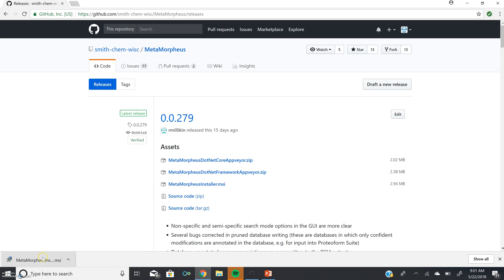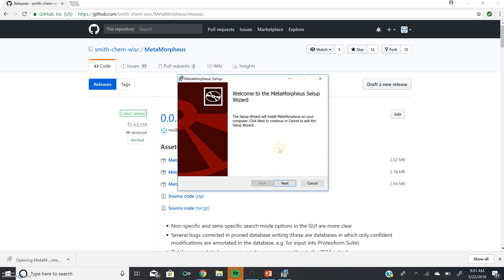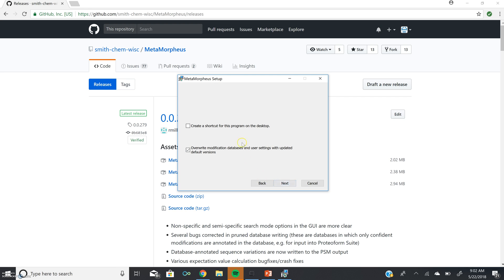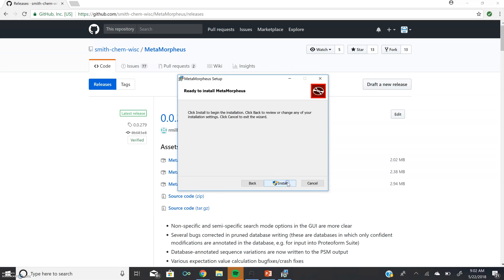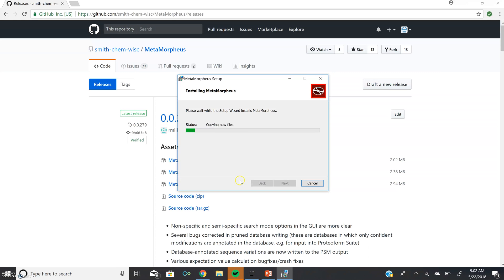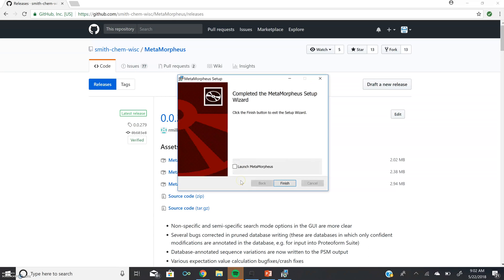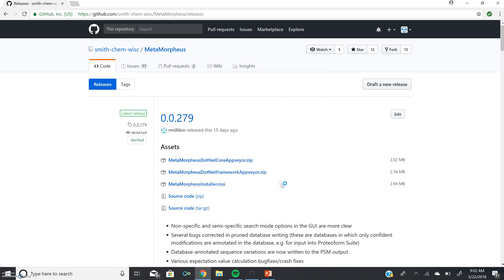So we will go ahead and we will open the installer, which will open up a setup wizard. We will click Next, and you'll notice that there are two checkboxes. The first, Create a Shortcut for this program on the desktop, is unchecked by default, but I always like to check this because I want easy access to the software program. The second is Overwrite Modification Databases and User Settings with updated default versions. This is checked by default, and we want it to remain this way. Then we'll click Next, and then Install. Then we'll go Launch and Finish.